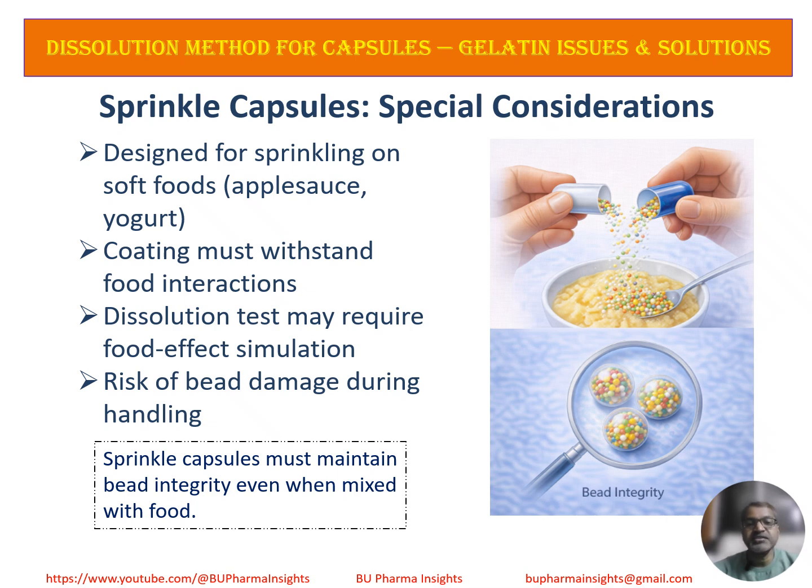Regulatory expectations include consistent dissolution performance, no damage to coating during sprinkling, and no premature drug release. In some cases, dissolution testing may need food effect simulation or modified media to reflect real use conditions.